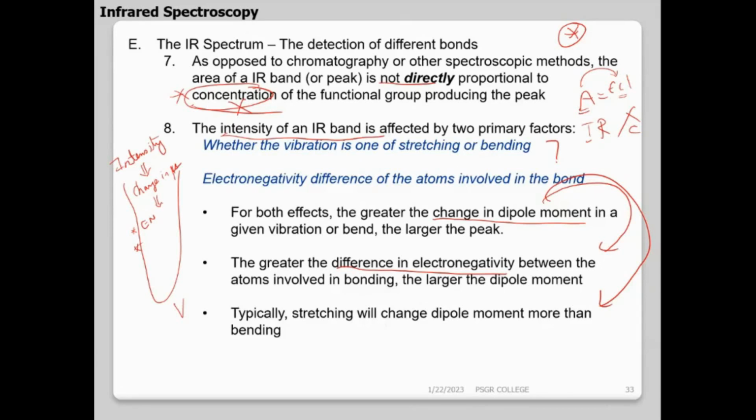What is symmetric stretching? What is asymmetric stretching? Symmetric means both will elongate, both will compress. Symmetric is rhythmic, the same way, nicely rhythmic. So both bonds elongate in the same way and compress in the same way. But if I say asymmetric stretching, it is not harmonious. One elongates while the other compresses. So that is asymmetric.